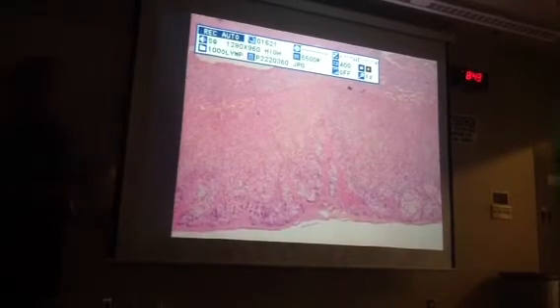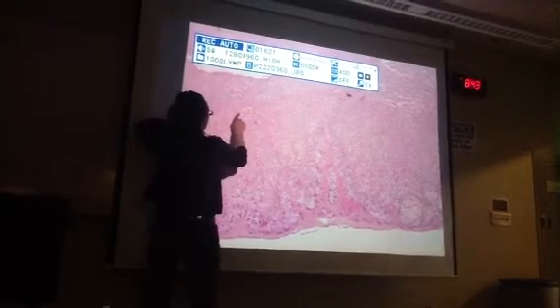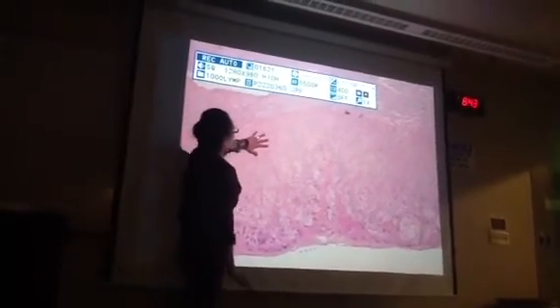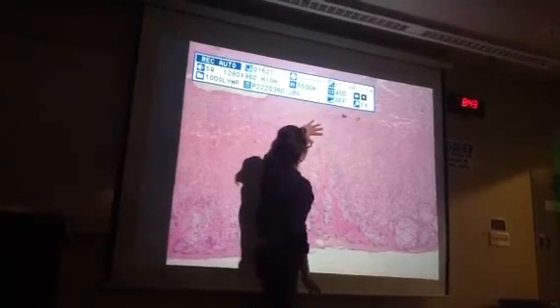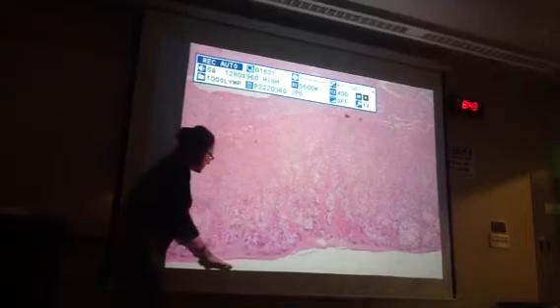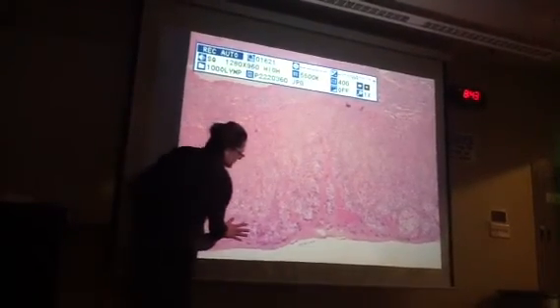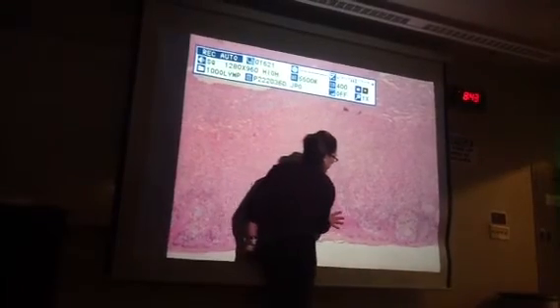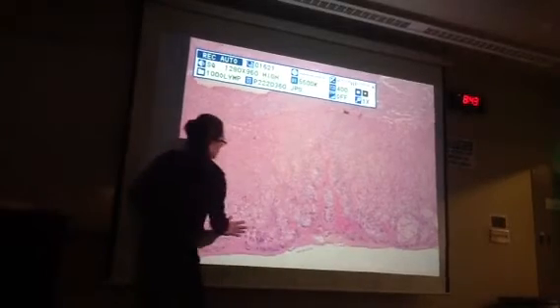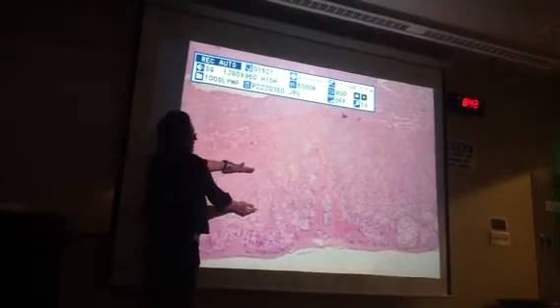Okay, so medulla is right here. Again, you can see the boundary. That's the edge of the medulla. Then the layer of cells right beside the medulla would be reticularis. Down here's the capsule again, and that layer of cells right by the capsule is glomerulosa. And then all of these cells here in the middle, that's fasciculata.